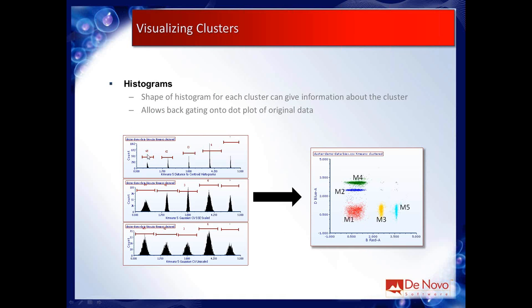So this is histograms where, for each cluster, it's a histogram of the distance of all the data points within that cluster to the centroid. So you can see some small differences in the spread of the data within the cluster. Here's another way of seeing it, though. We've got little Gaussian histograms. Each one is a little Gaussian, but they're scaled to the sum of squared error, kind of like the variance of each individual cluster. So the clusters that are more spread out are going to be wider here. And M2 is kind of a narrow cluster, so you'll see its histogram is a little bit narrower.